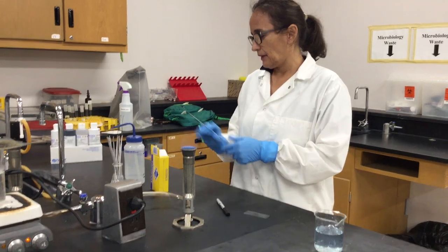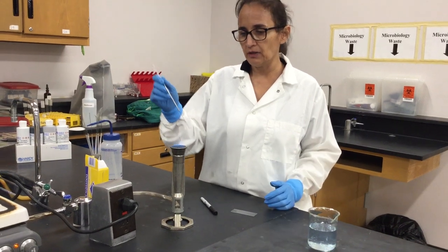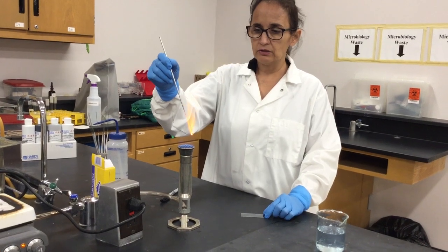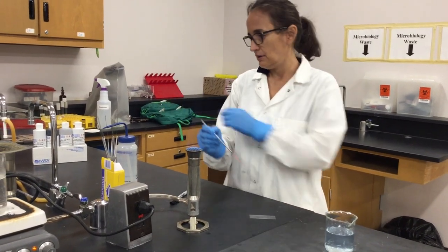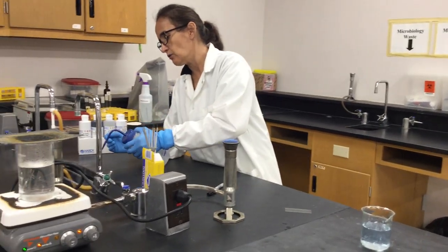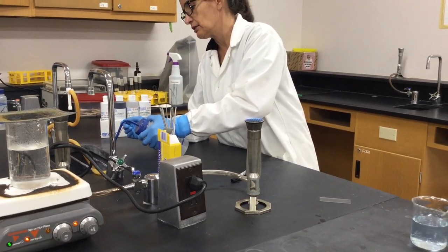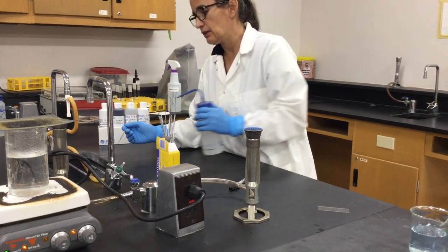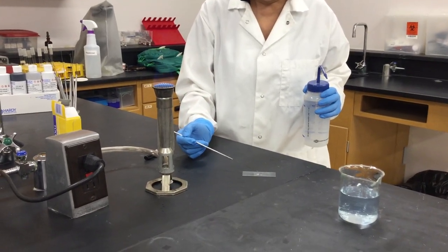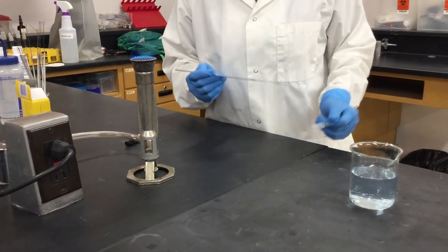So, for diluting the debris and the bacteria that you have in your gum line, you have to add water to the center of the glass slide. And then you will sterilize your loop first, and then add water with your squirt bottle, which has distilled water, in the center. In this case, you don't have to wait for it to cool because this is not going to affect anything. But see, you have a droplet of water there. And I think that it's more than enough. So let me show it close to the camera.